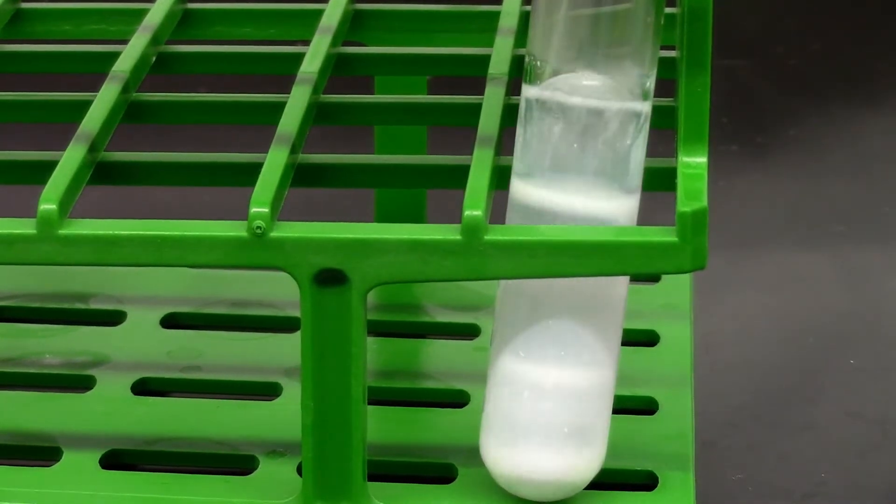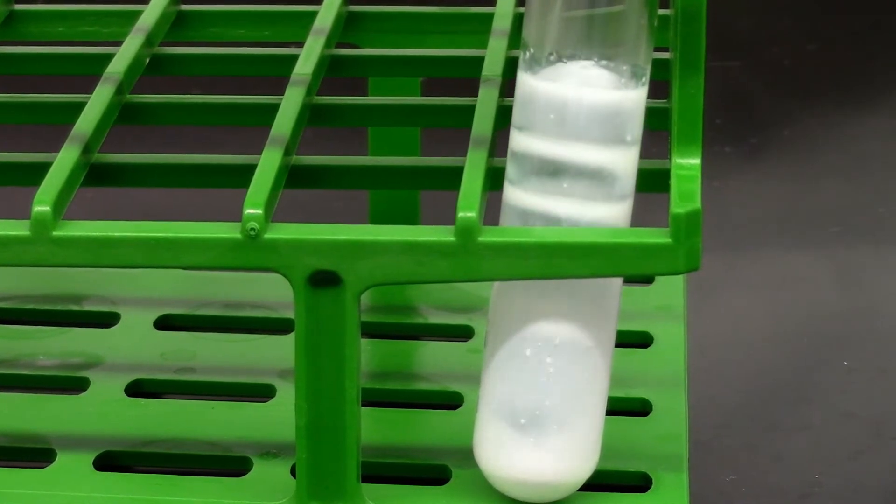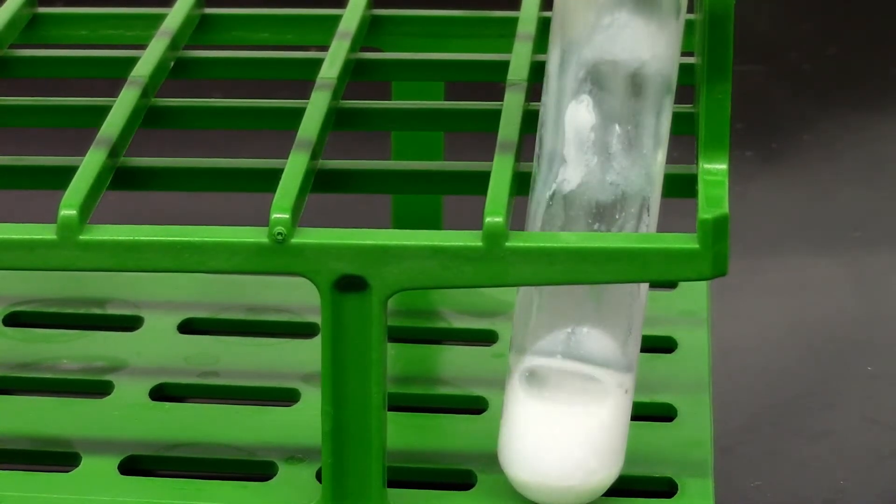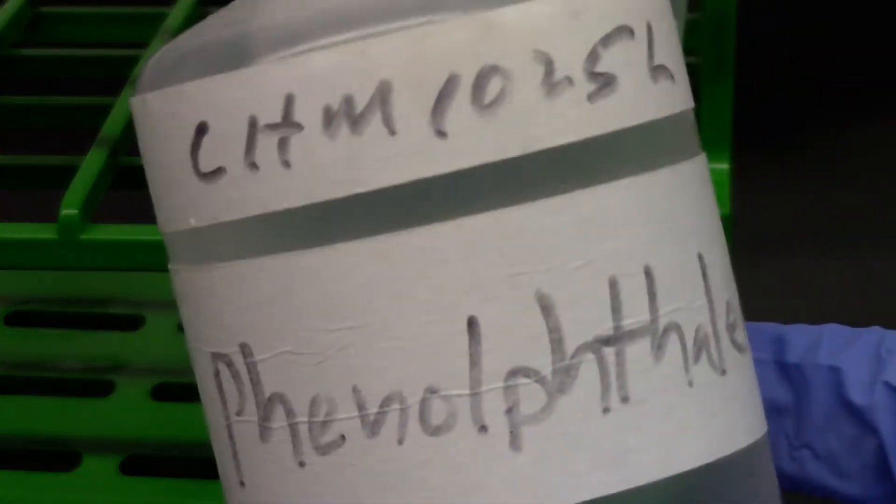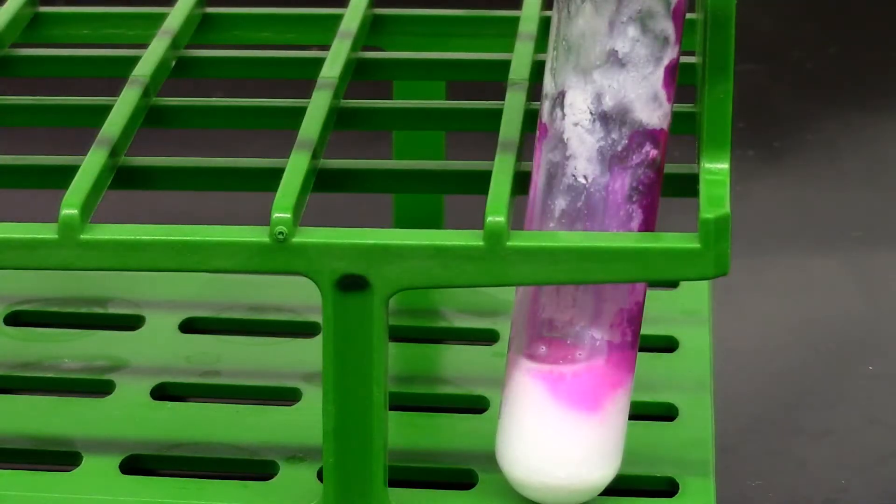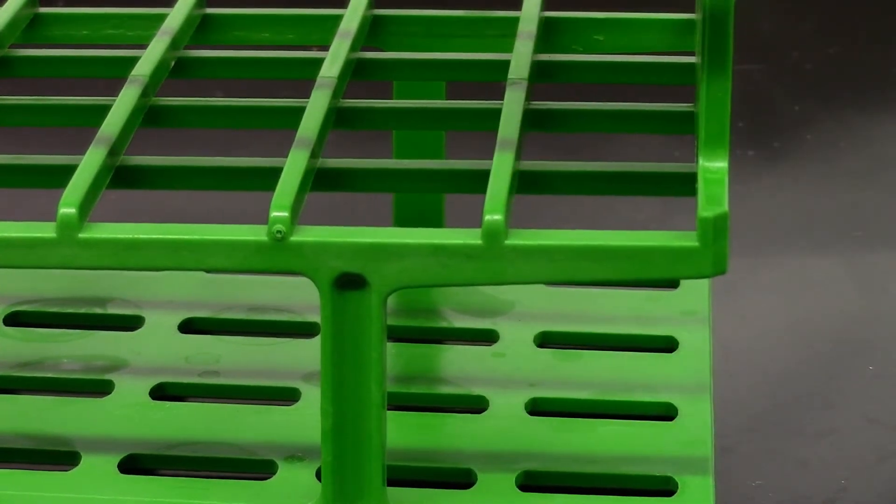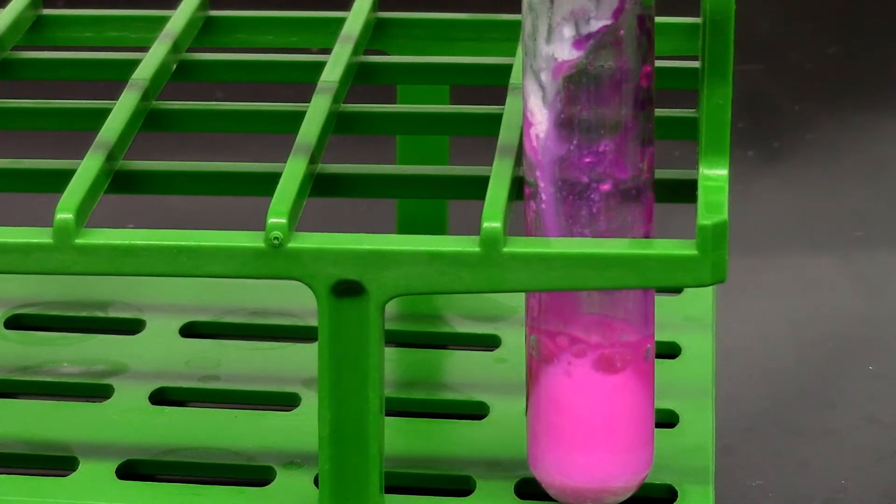You see gas evolving. That's hydrogen gas. You see the white precipitate which is calcium hydroxide. I'm going to add a couple drops of indicator phenolphthalein. And you can see it turns it pink which tells you it's basic and calcium hydroxide is being formed.